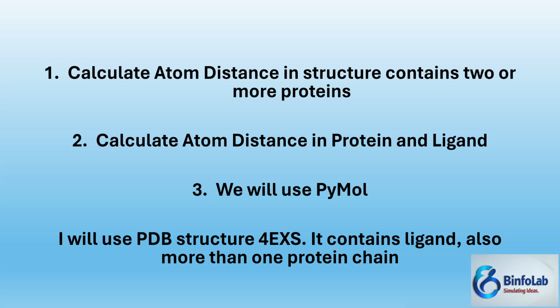Why do I use PyMol? Because I have covered its installation, its publication quality images, tutorials, and all these. And also, I believe it is one of the most state-of-the-art software for generating publication quality images. In today's tutorial, I will use the PDB structure 4EXS. You can download it for yourself if you want to follow this tutorial exactly.